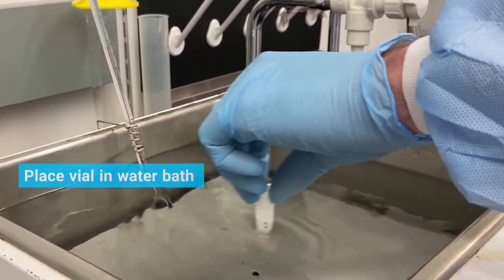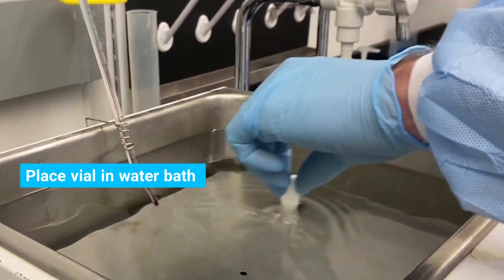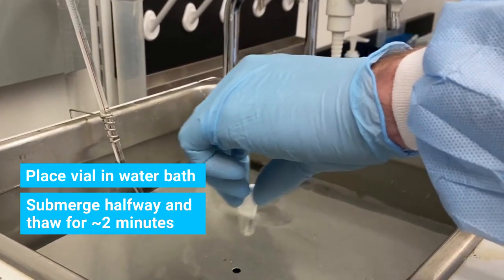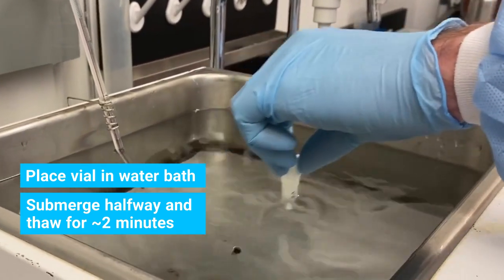Place the vial of cryopreserved PBMCs in the water bath. Submerge the vial halfway and thaw for approximately 2 minutes by gently swirling in the water.